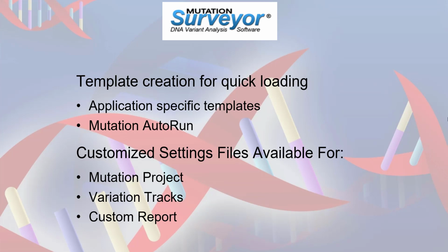Please keep in mind that when a saved project file is loaded, project settings are updated to those used in that project, which may not be the appropriate settings for the next project run. Loading configuration files can help guarantee the proper settings are always applied in your project. Configuration files are also utilized in the Mutation AutoRun Tool when wanting to apply settings different from those last used by the software. So where in Mutation Surveyor software can you apply custom settings?